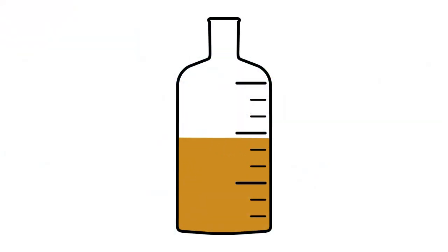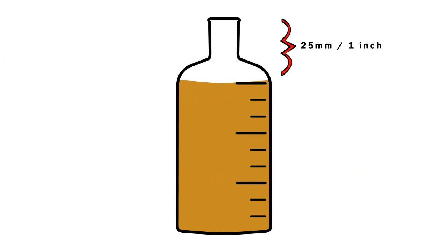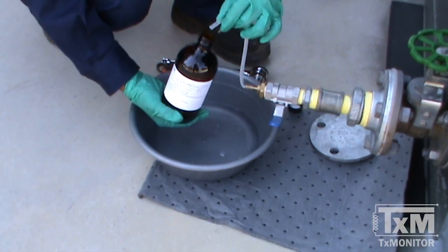Fill the sample bottle leaving approximately one inch of space at the top of the bottle to allow for expansion. Cap it immediately.